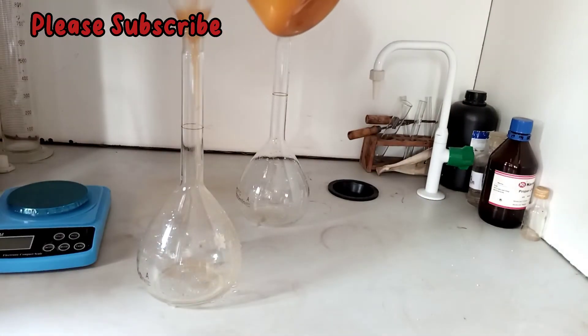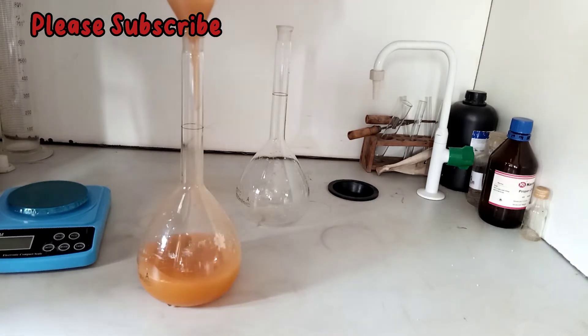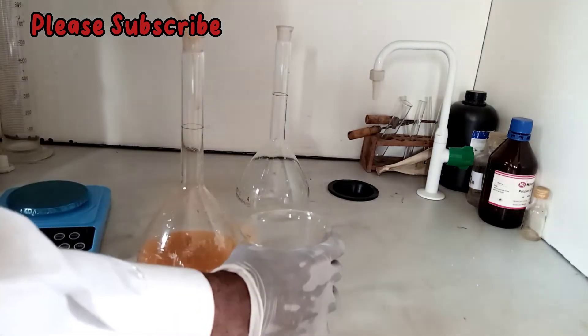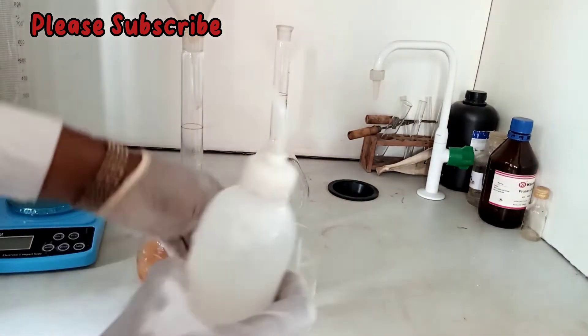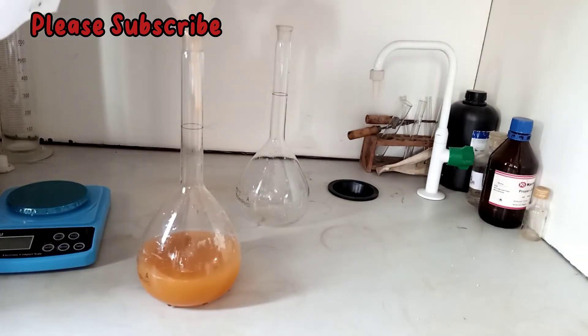First by pouring the solution into the standard volumetric flask, and then you add distilled water to the 1000 cm³ mark. And that is how we prepare 0.1 mole of iron sulfate heptahydrate. You rinse out the particles left thoroughly into the standard volumetric flask.